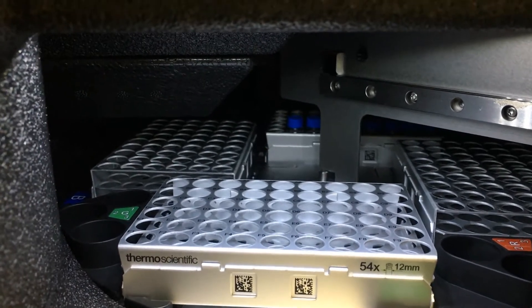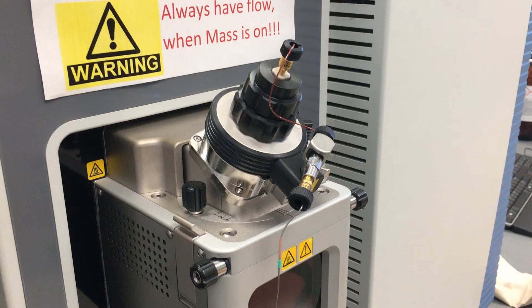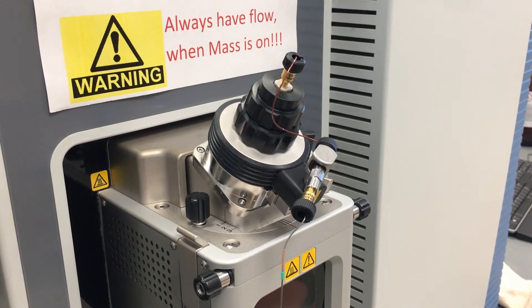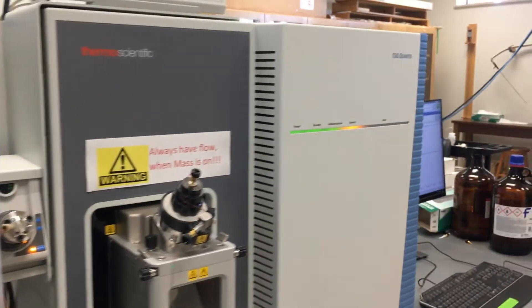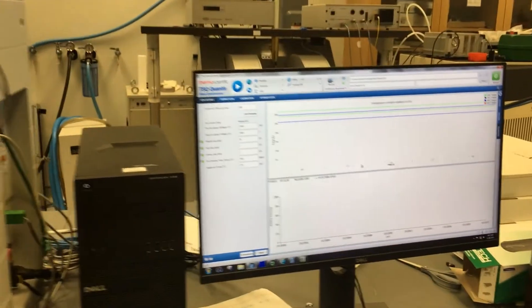For structural mass spec, a common sequence is product ion scan, precursor ion scan, and neutral loss scan, followed by selected reaction monitoring (SRM) or multiple reaction monitoring (MRM).